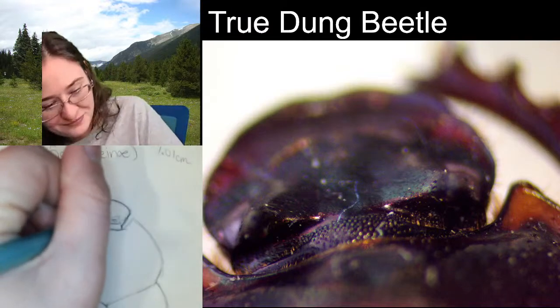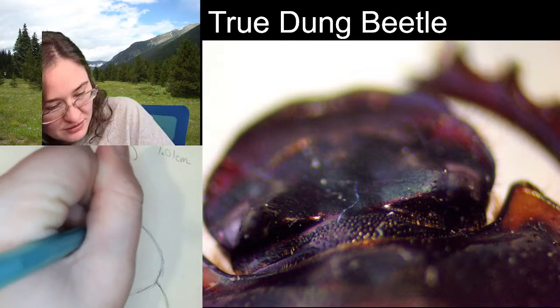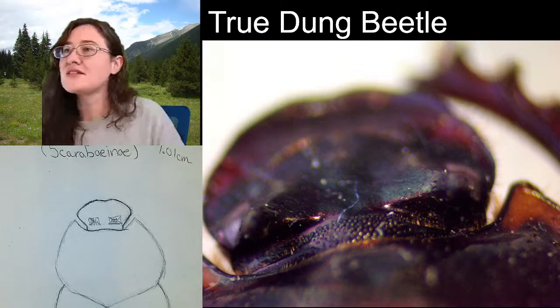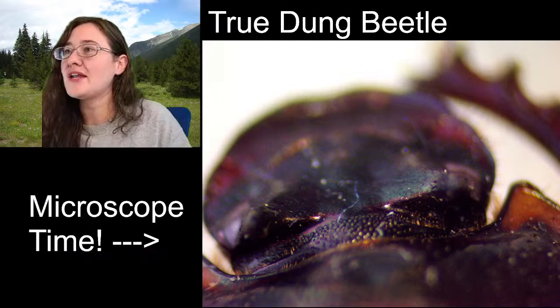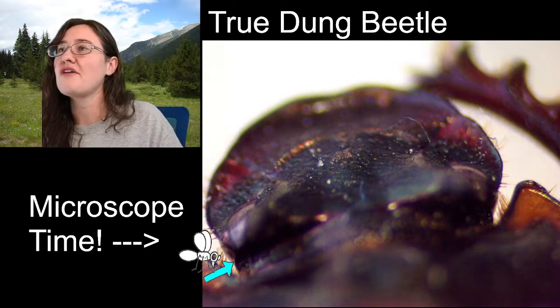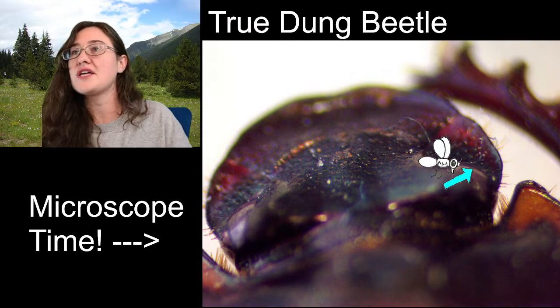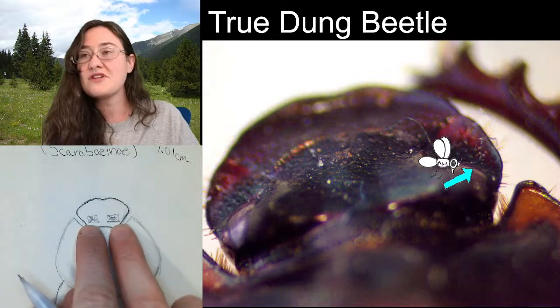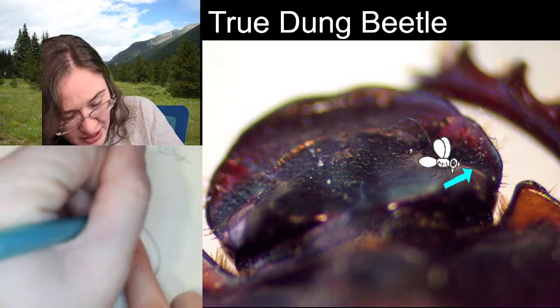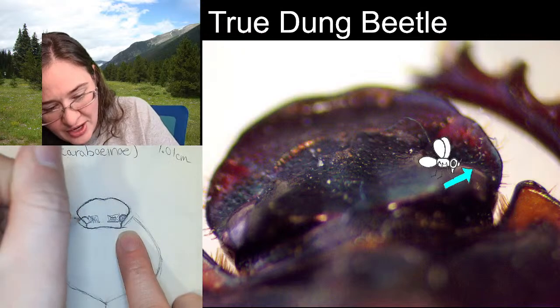Well, we know that these horns are here. And then our compound eyes are just below. So I'm going to go ahead and focus down just a little bit. Right there, you can see where the compound eyes are. They're off here to the edge. One's right about here, and the other one is right around here. So if you are taking your sketch, we have these horns, and then off to the left and off to the right, that's going to be where their compound eyes are.